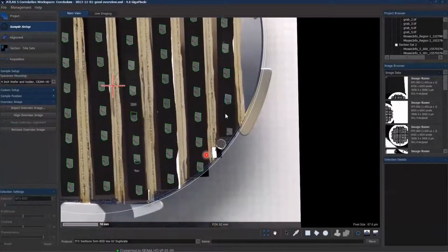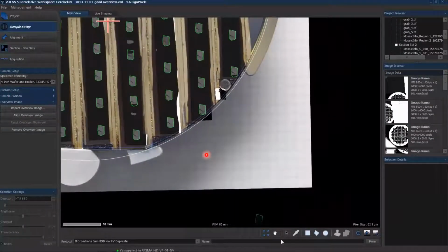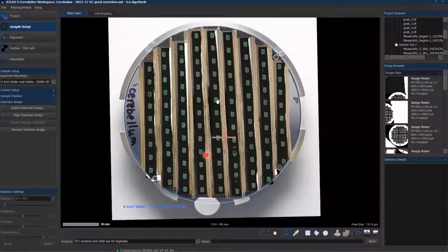Those sections are barely changing over the course of a couple of sections, so they look very, very similar, at least on those tapes here. And then you can move and click each of those, and this template from the very first section eventually snaps onto all of them. And within a minute, make it two, you have pretty much told the electron microscope where all the sections are.